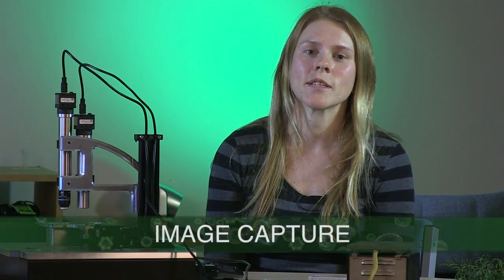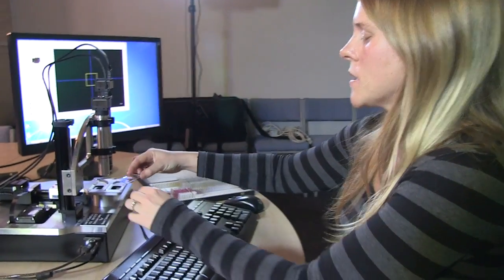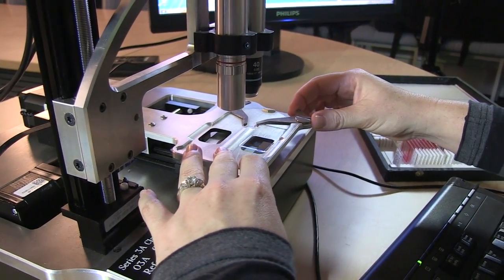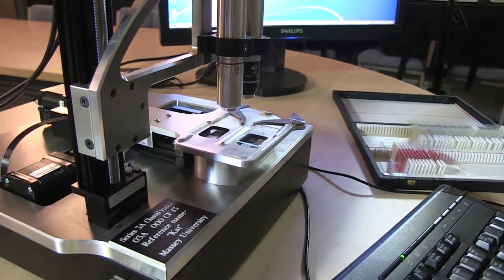Now we've got the slide prepared, it's just a simple matter of popping it on the classifier stage. So then we take the prepared slide and place it on the stage of the classifier which is essentially the same as a standard microscope stage and then we load the slide on.